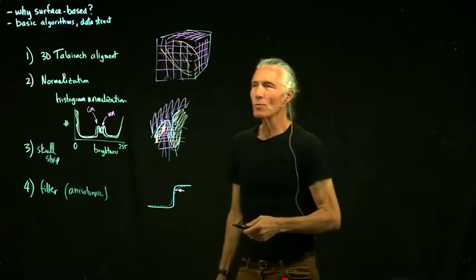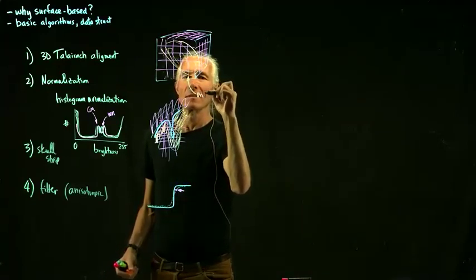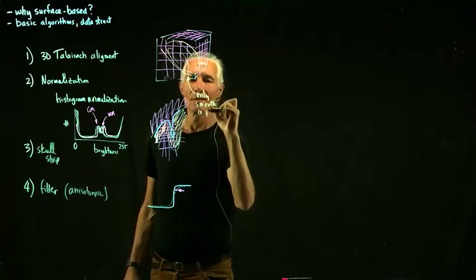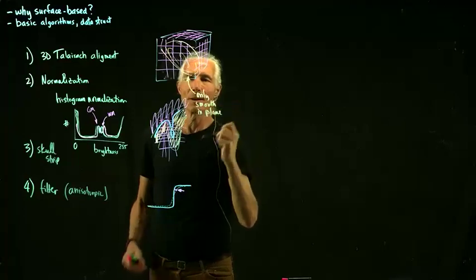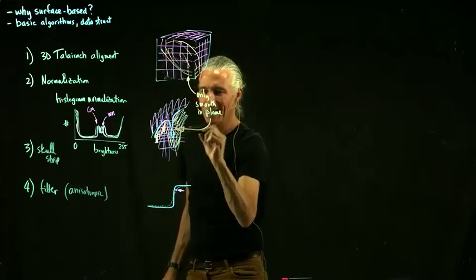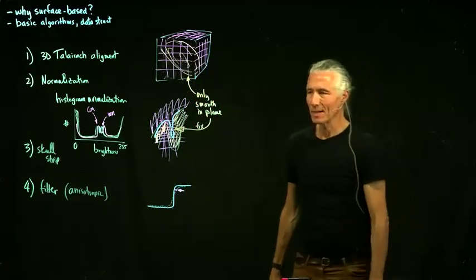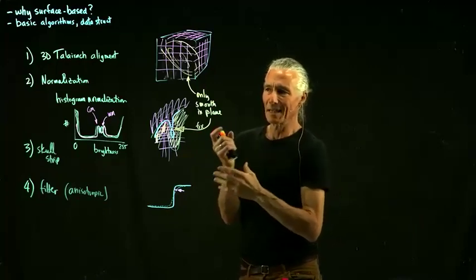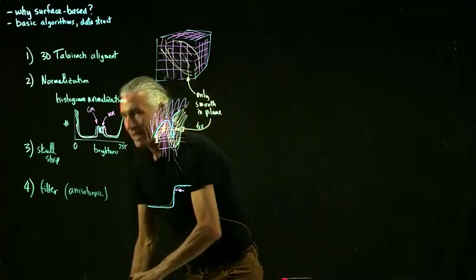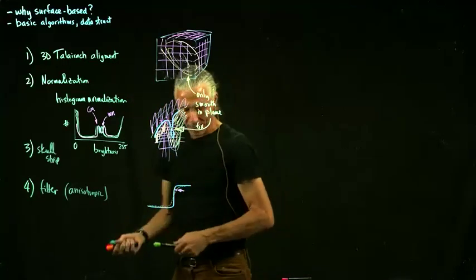And then only smooth in the plane. Only smooth in plane. That will blur the data a lot less, and it will fix those little speckly problems. If you don't do this, like I said, there are way too many voxels to fix by hand. You're not going to fix 10,000 examples of that. So some kind of filtering is pretty critical.